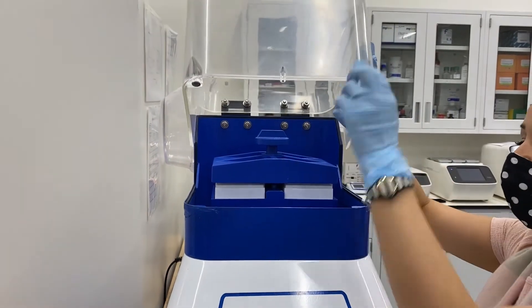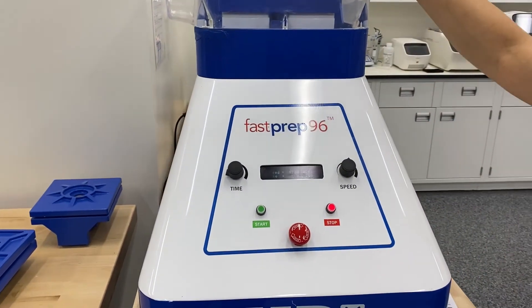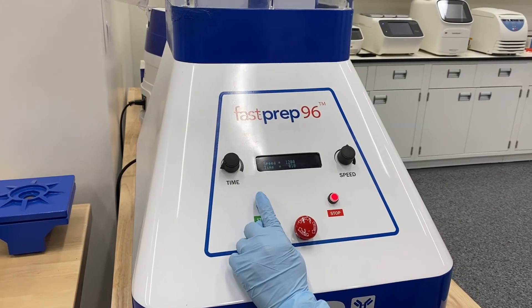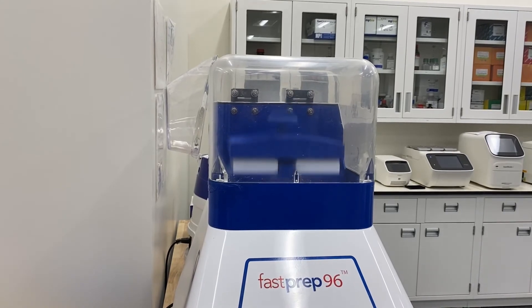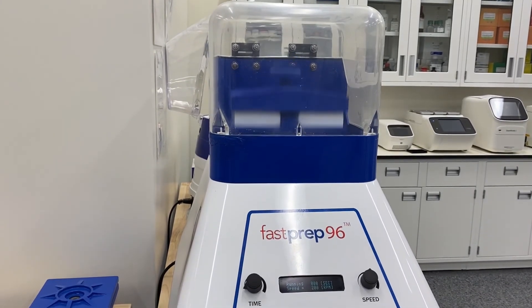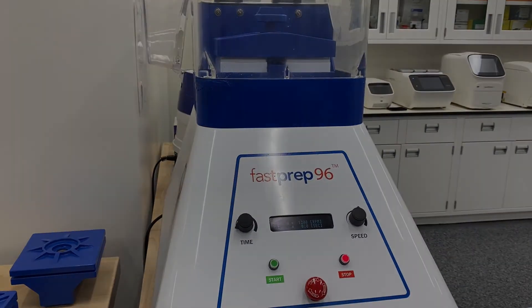So we'll close this, and there are magnets here to keep this closed. Just make sure you don't shut it hard. And again, for today's demo, we'll run 10 seconds, so very simple. Hit start. And that's today's demonstration.